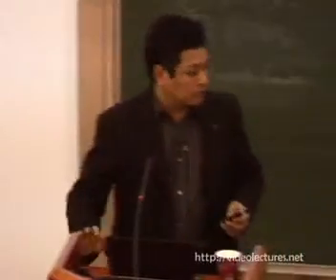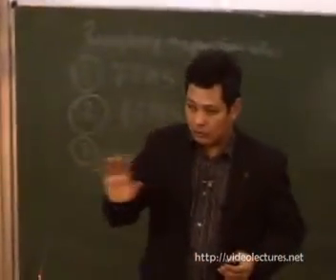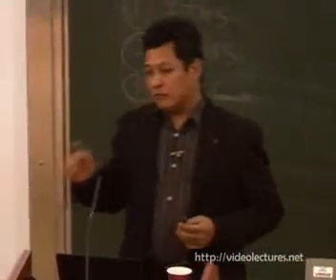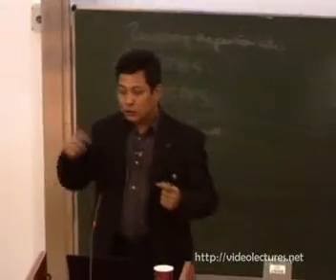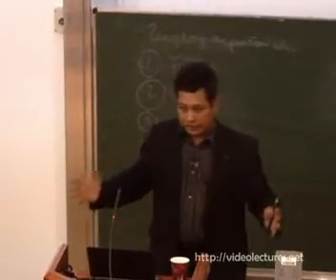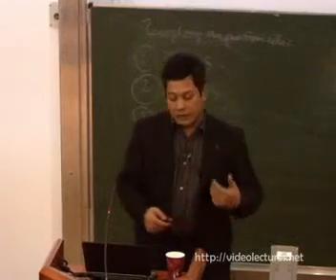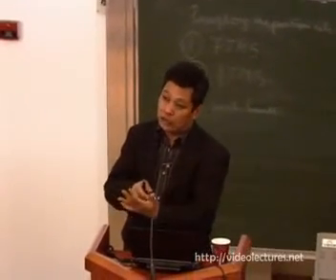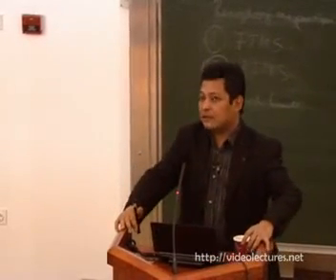Okay. So the manipulation technique is not an engineering technique to assemble for production. Yes, it really takes time, especially if you want to have beautiful images. So we move, take the image, take the image. It really takes time. What we do here is isolate and study these molecules and how they work.